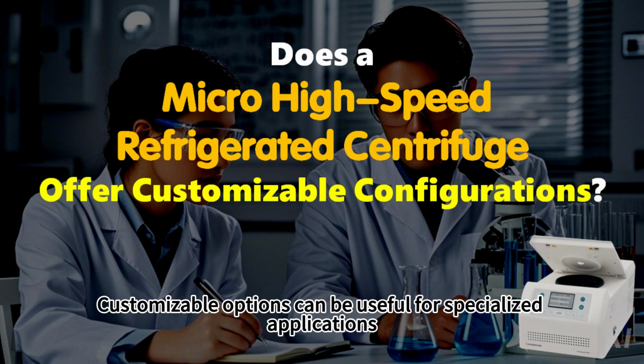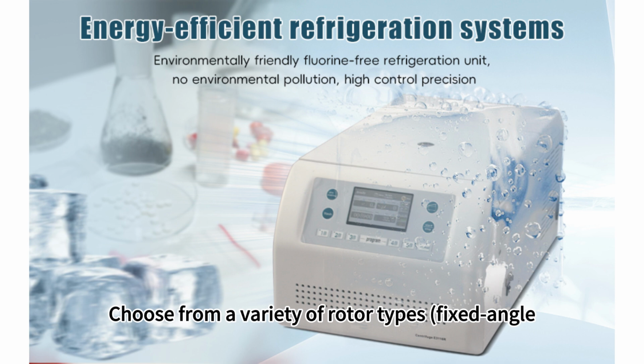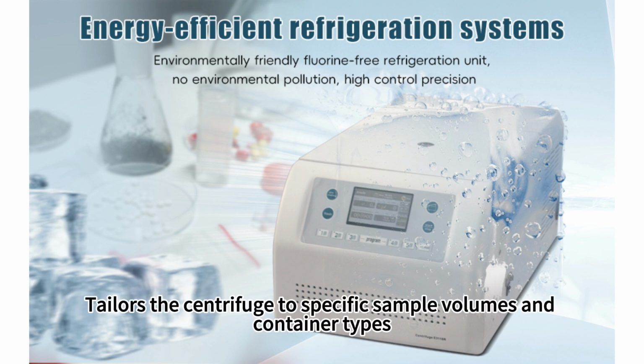Customizable options can be useful for specialized applications. Customizable configurations, rotor selection, option. Choose from a variety of rotor types, fixed angle, swinging bucket, etc. Importance. Tailors the centrifuge to specific sample volumes and container types.